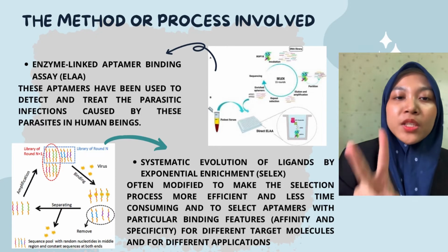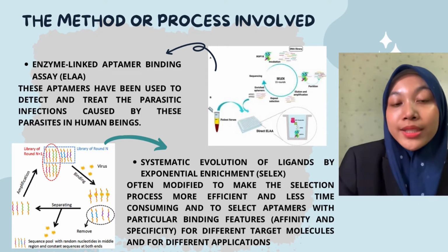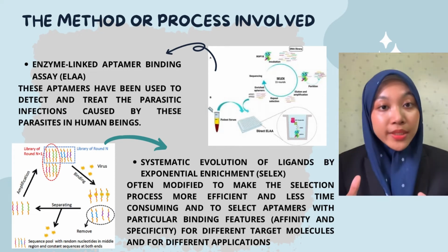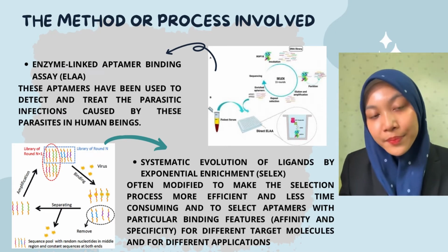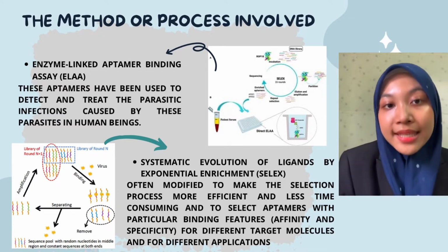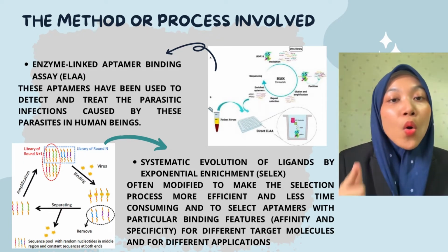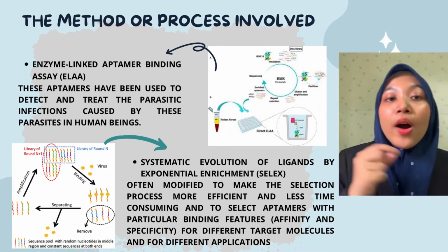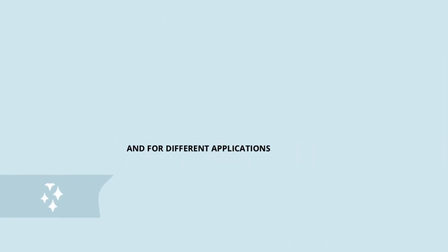The second step is when sequences that bind the target are kept, while unbound nucleotides are removed. The third step is to purify and amplify the bound sequences to form a new sequence pool for the next cycle. A negative selection or counter selection step involves incubating the sequence pool with target analogs, undesired subtypes, or the unbound sequences. This step can take place before or after target incubation to improve the specificity of candidates.